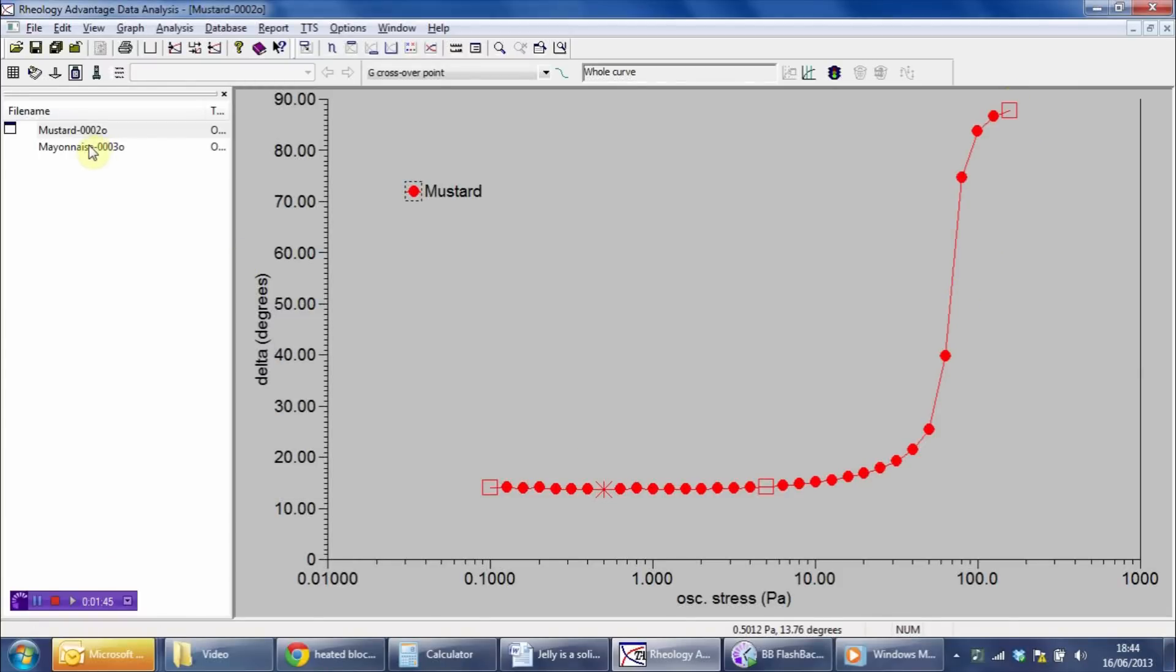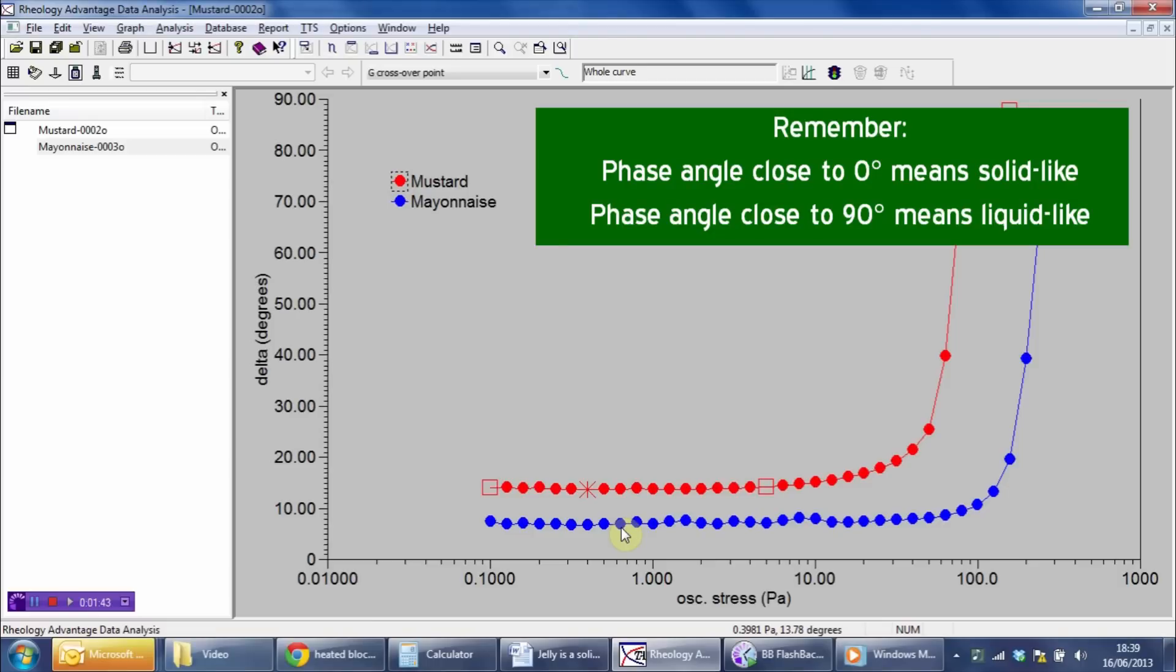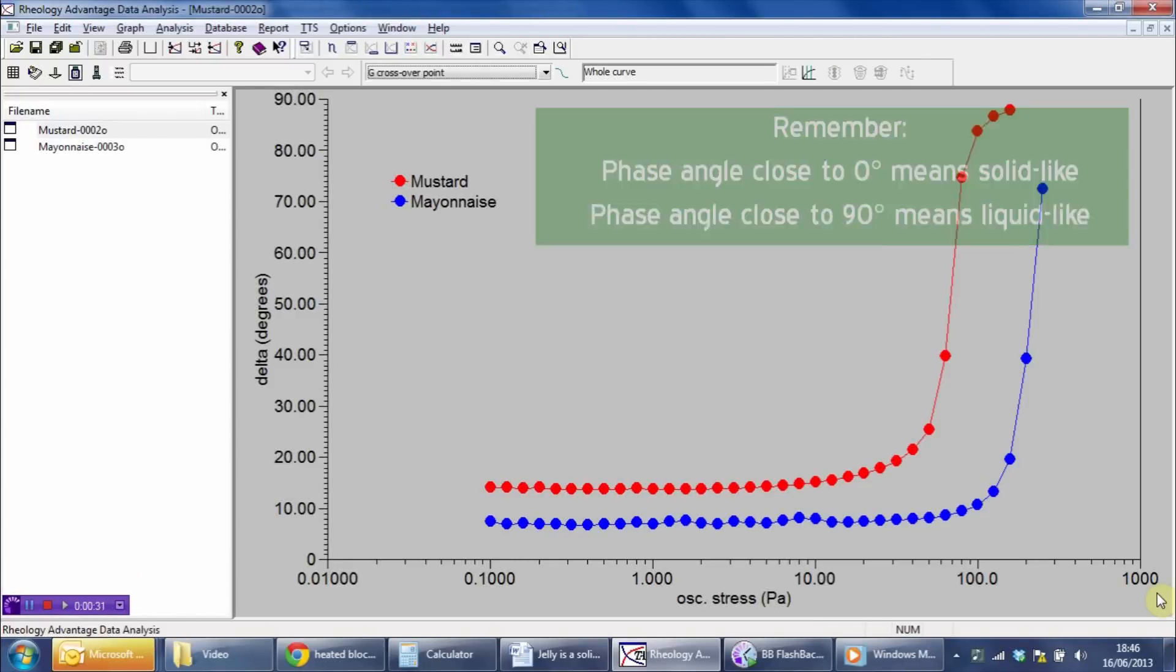Let's now compare this to the mayonnaise. What we can see with the mayonnaise is, firstly, the mayonnaise has a lower phase angle in the plateau region here. That tells us that the mayonnaise structure is a little bit better developed than that of the mustard. More strikingly, we can see that the mayonnaise yields at a significantly higher stress than the mustard.